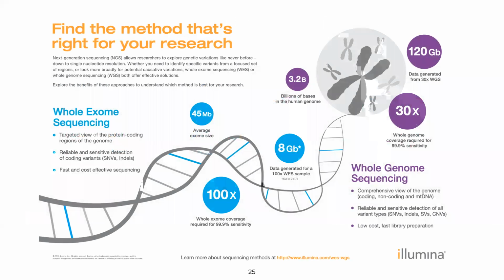If we just take a look at Illumina sequencing, Illumina actually adopted just one of the sequencing technologies. Originally, there was Sanger sequencing, and Sanger sequencing remains a gold standard for accurate identification of DNA variation. However, Illumina has proven that the shotgun sequencing approach is both accurate enough and computationally easy enough to analyze for it to become the de facto standard in sequencing.